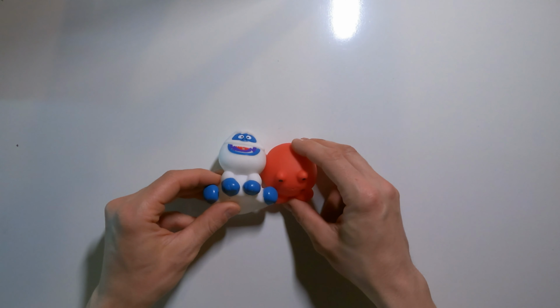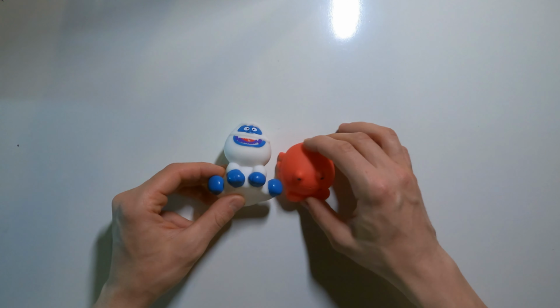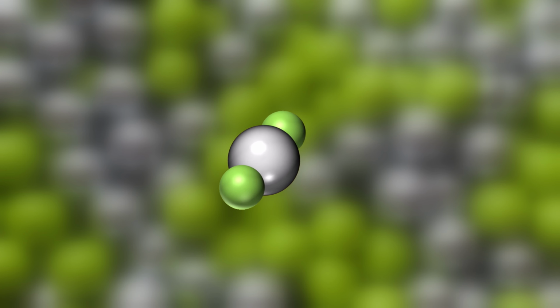So using our dancers on the dance floor analogy, we had tin and we had chloride, which were bonded together. When we hit the tin chloride with some electricity, the chloride went off and formed a gas. And the tin was left as a metal in that petri dish. It's actually one of my favorite decomposition reactions. If we were to illustrate this reaction, it might look a little bit like this.